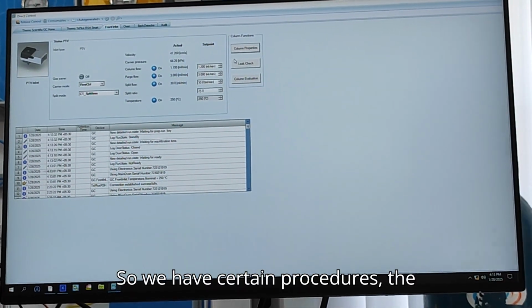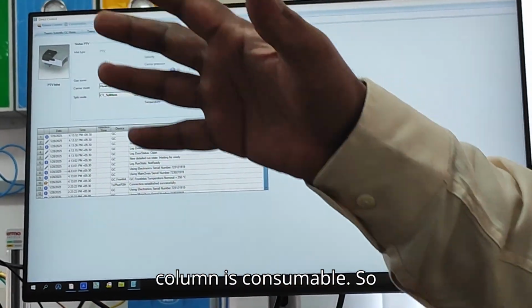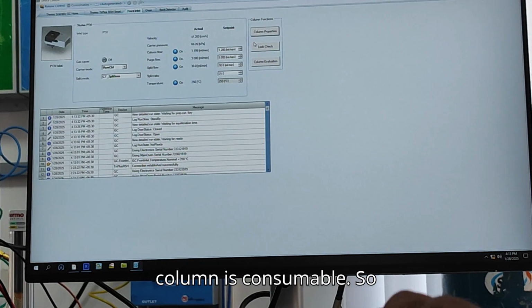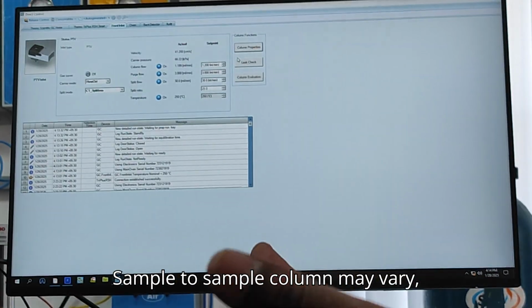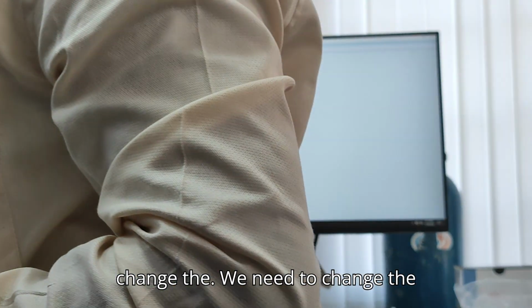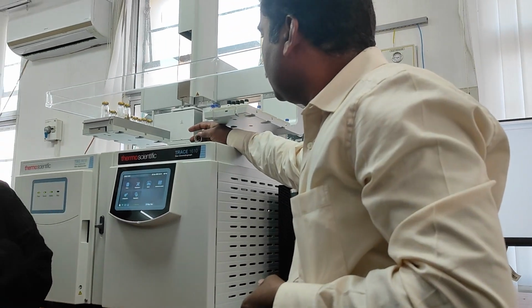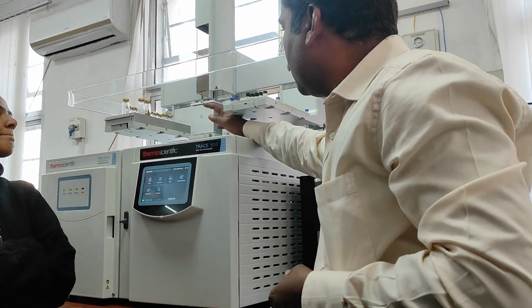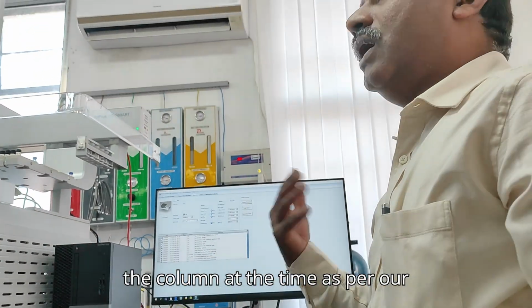And sometimes we have certain procedures, the column installation procedure. Because the column is a consumable, it depends on your type of sample analysis. Sample to sample the column may vary, chemistry also may vary. So we need to change the column and install the column all the time as per our requirement.